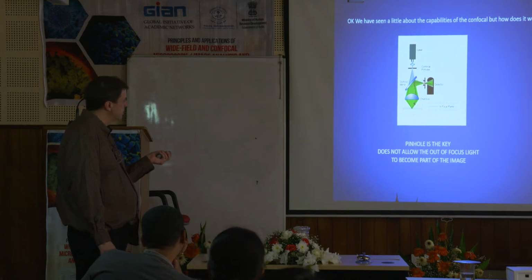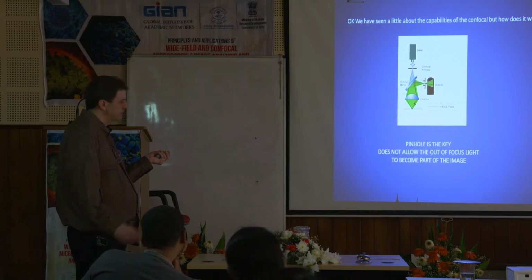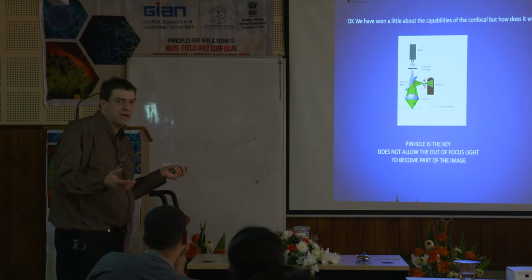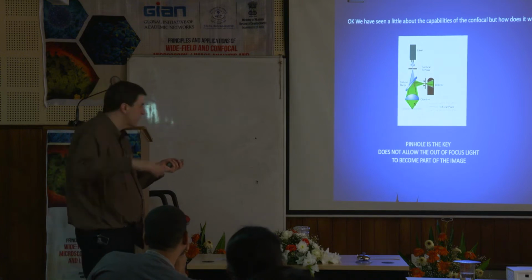So here the pinhole is right here. This light is stopped from above, and the light from below is stopped. Okay, so it's just a schematic explaining what I was trying to show you with the piece of paper.